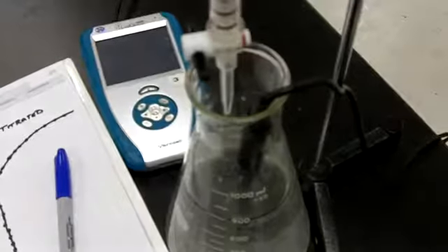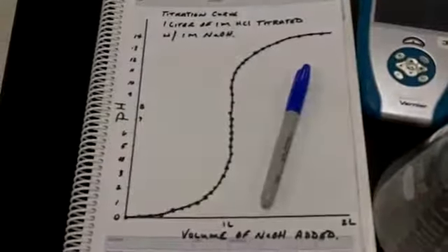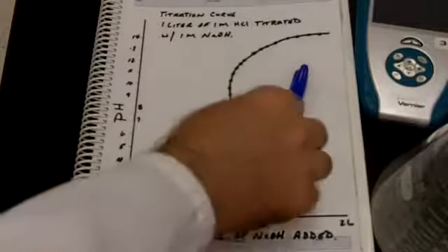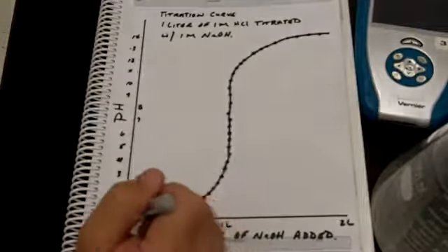And I want to discuss that titration curve with you. That's really the basis of this lesson. So let's talk a little bit about what's happening in this titration. So remember again that what I did was I titrated a strong acid with a strong base.